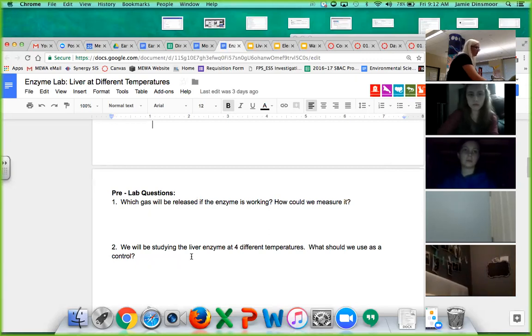I guess the hot doesn't work on this one. Try to let this water warm up a little bit so it's not so chilly. Okay, there's like slime left over on that sink.